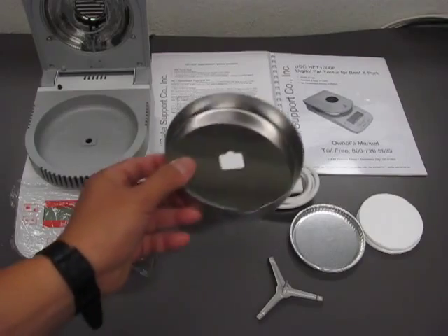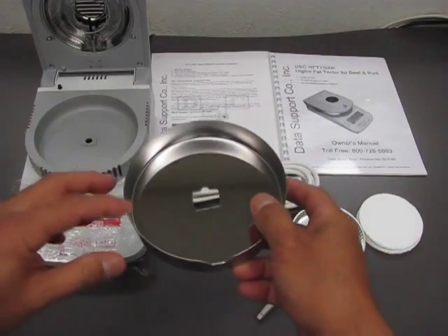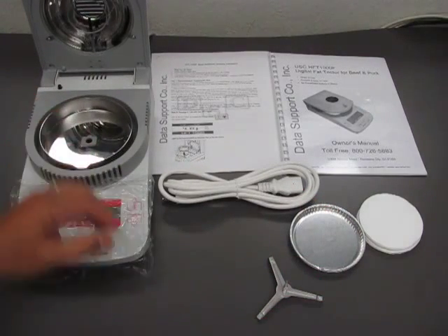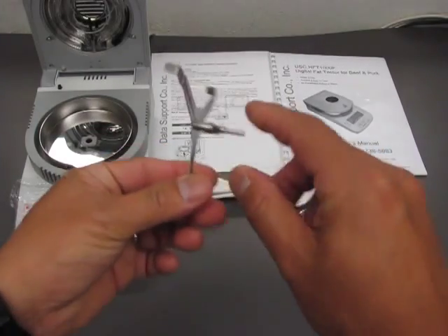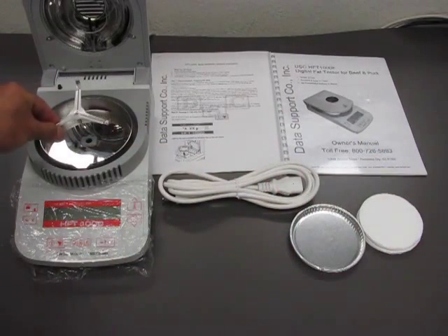The first thing you need to do is install the drop shield. Take note that this is a hole which should match the one at the middle of the test chamber. Then you insert the pan support, and take note that this is a stem that goes through the hole at the center of the test chamber.